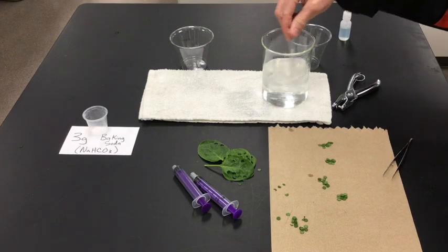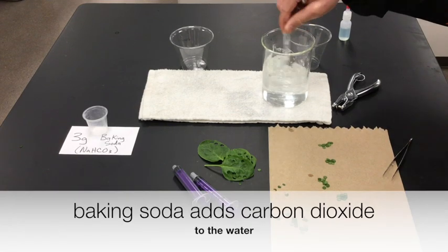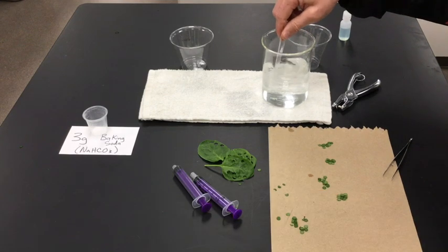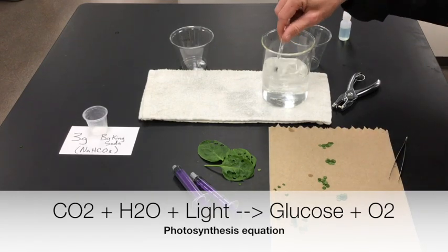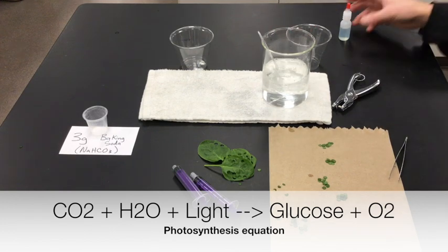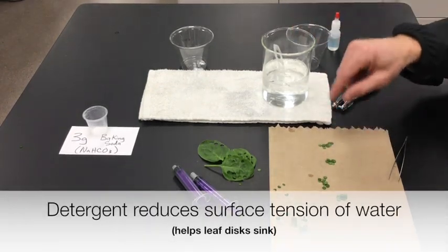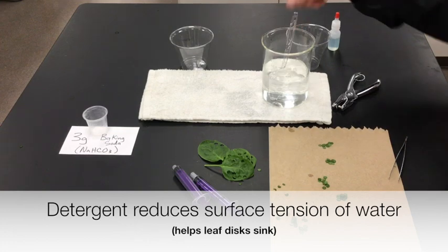The baking soda — sodium bicarbonate — is going to be a source of carbon dioxide. It will dissolve in the water, and in photosynthesis the plant cells need to start with carbon dioxide combined with water and light energy to yield an energy molecule like glucose and release oxygen. The detergent just allows the leaf discs to sink, preventing them from sticking to the surface of the water.